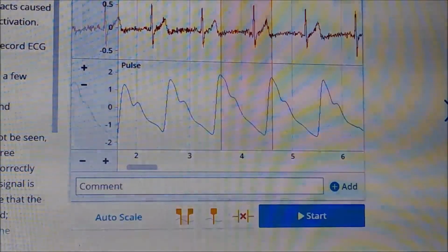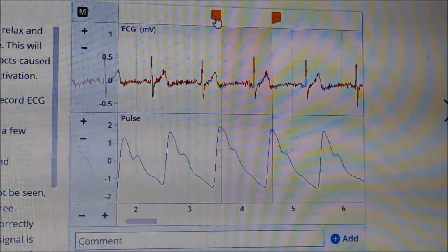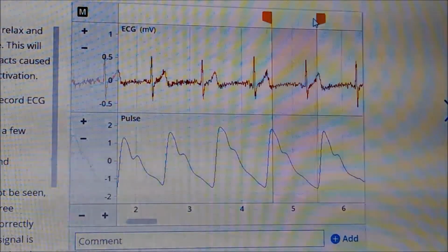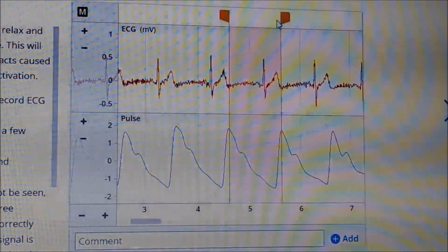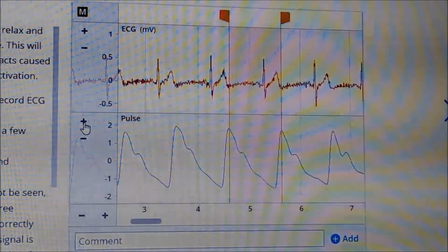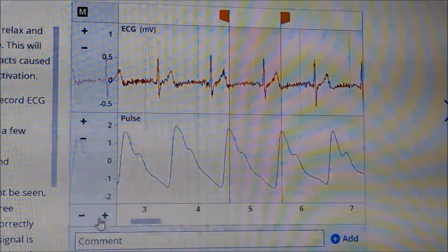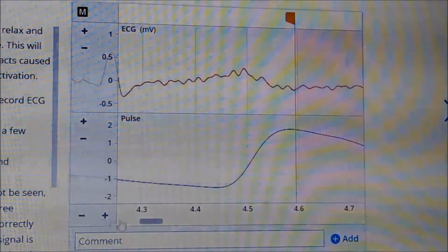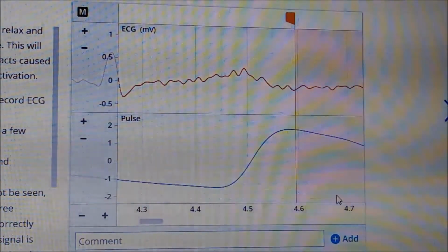So now I've just zoomed out and I'm going to adjust my bracket tool to the next adjacent pulse wave and repeat the process of measuring the duration. We want to do that for a total of 3 pulse waves in a row.